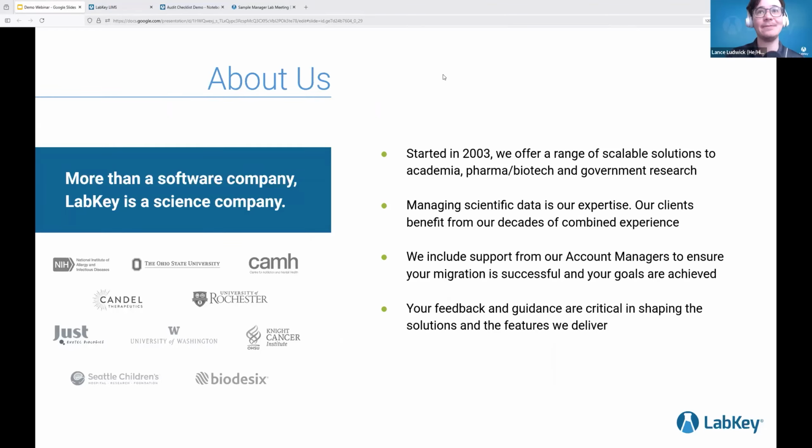As you're answering that poll, we'll go ahead and dive into who LabKey is. Who are we as a vendor? LabKey started in 2003 as part of the Fred Hutch Cancer Research Center here in Seattle, Washington of the United States. Since then, we've partnered with a bunch of different organizations from academia to pharma biotech, government research, and a bunch of biobanks. So we're really experts in managing scientific data.